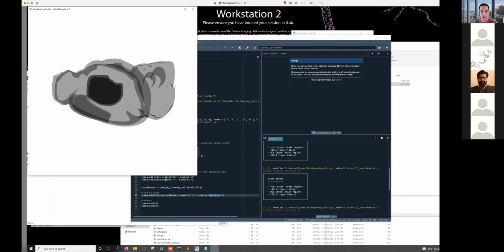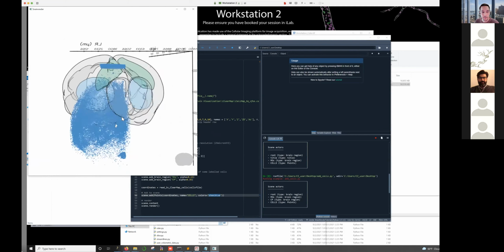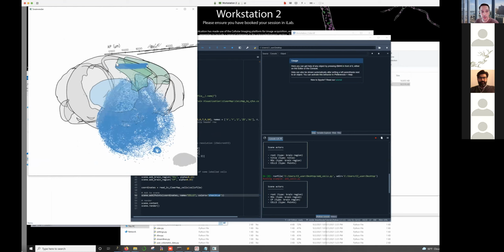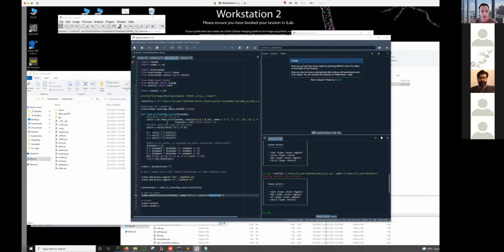And this might take a little bit longer now because there's actually a lot of cells in that file. And you can see it's not looking so good right now. We can definitely see the points. If you joined for the ClearMap tutorial, then you'd recognize this block up here as kind of the artifact from the glitches in the image, but this is the whole brain just here. But the orientation is not correct. To fix this, you can try and think about what orientation might be wrong, or you can just try changing these. In the case for this ClearMap, switching these axes should fix that problem.